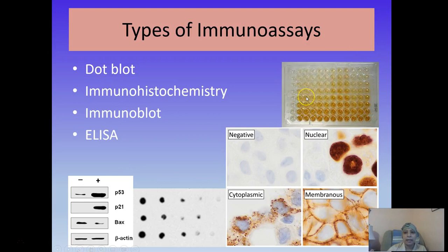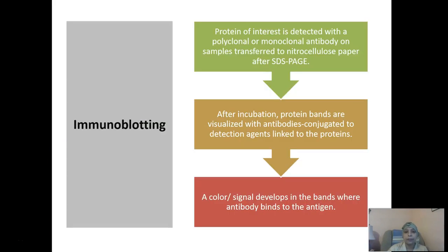And then you have ELISAs, where you use a standard curve of sorts using purified protein or purified macromolecule of your interest, and you compare it against your unknown samples, and you are able to actually quantitate, in many cases, the amount of sample that you have.